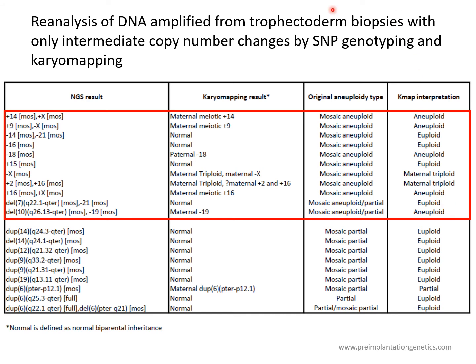So this is a very difficult situation because it means that there are limitations, at least at this stage, and these samples go back to NGS-based analysis 3 or 4 years ago, and the techniques have improved, including the introduction of artificial intelligence and so on.